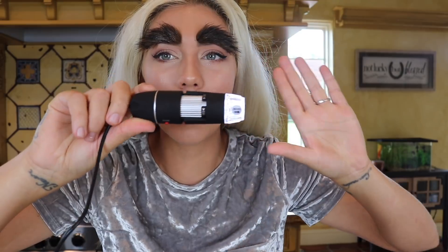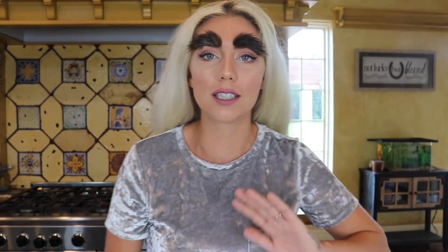This right here is my microscope, and believe it or not, you wouldn't think this actually has an insane magnification, but it does. Let me show you — that's my face. I don't want to go too deep into my face because I want that to be another video. Okay, so let's go into slime.